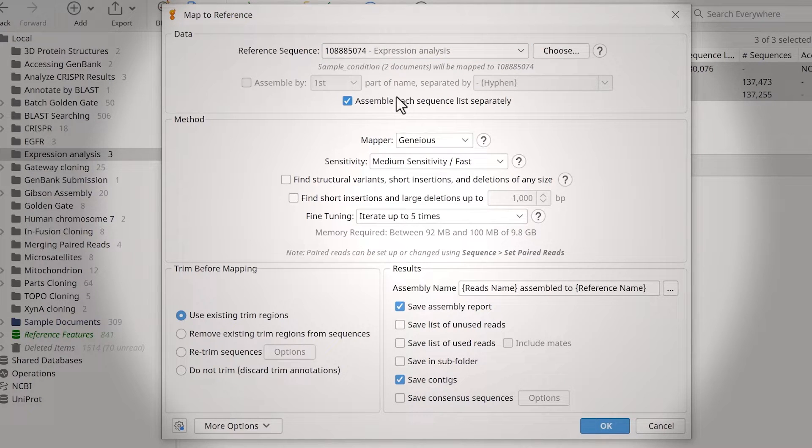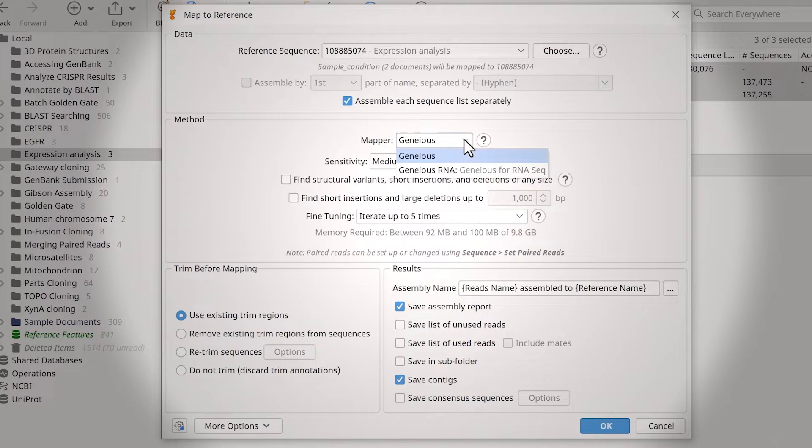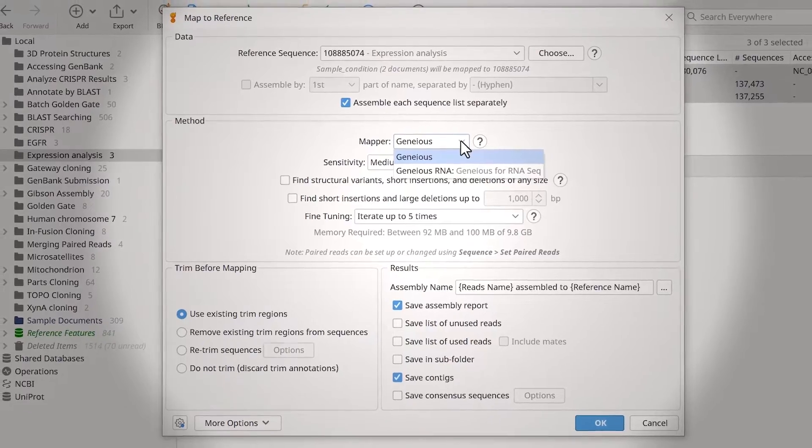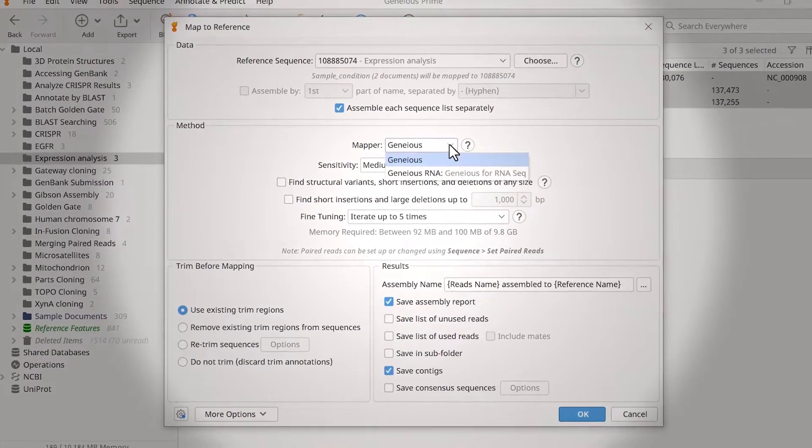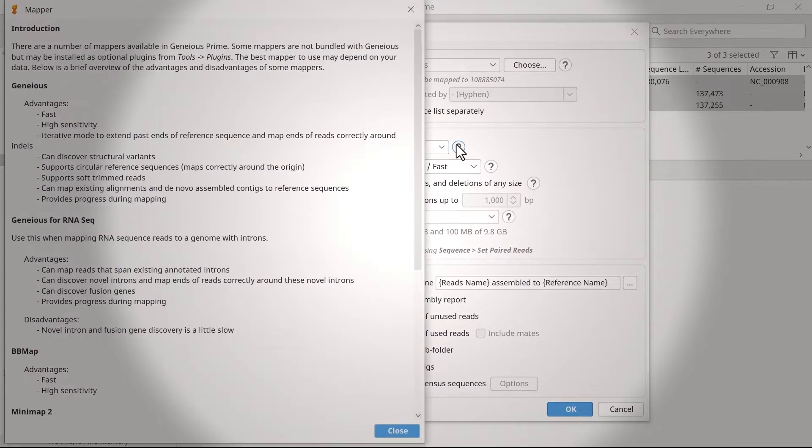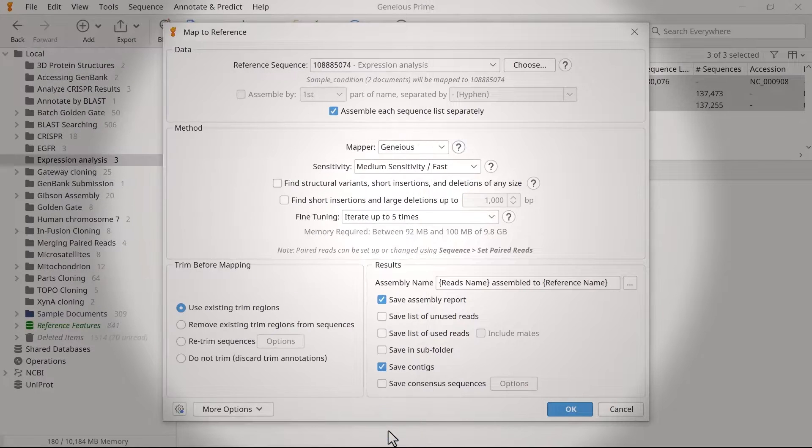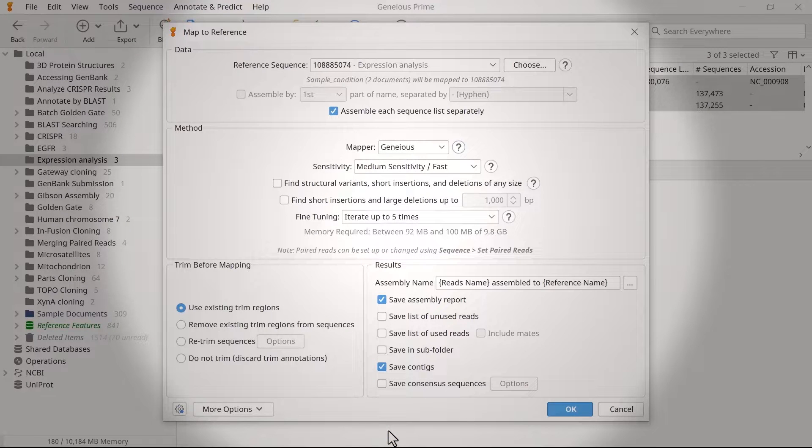In the Method section, specify the mapper used in the analysis. There are numerous mappers available in Genius, each with its pros and cons. Learn more about them by selecting the Help button. For this example, I will leave these settings as default.